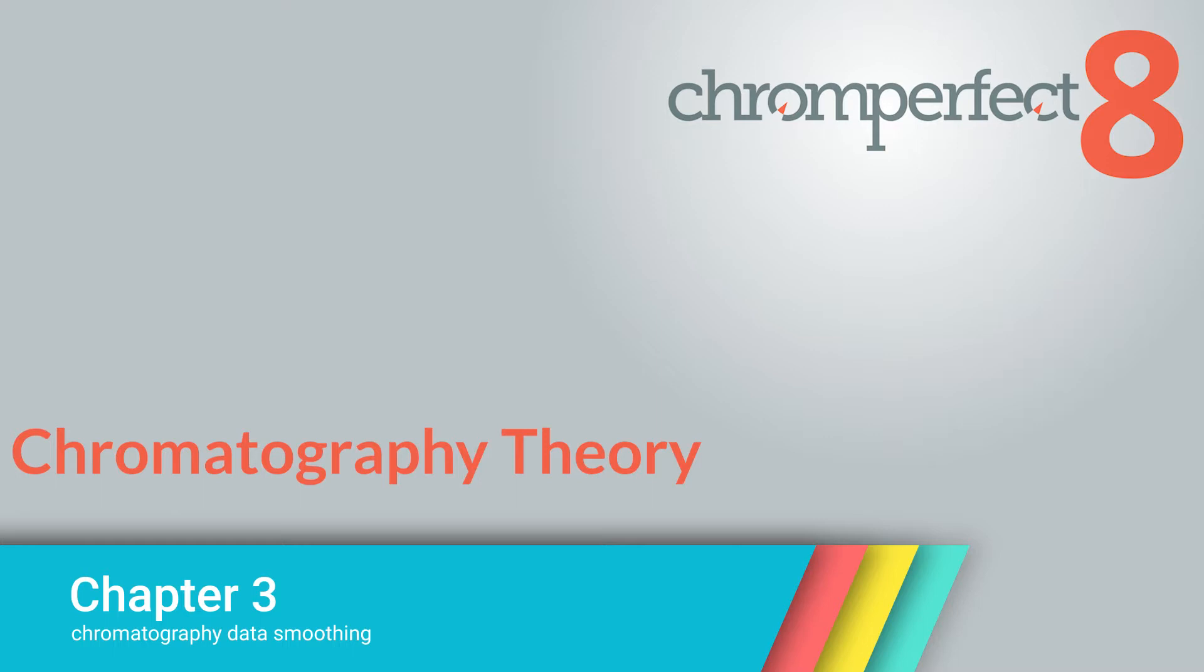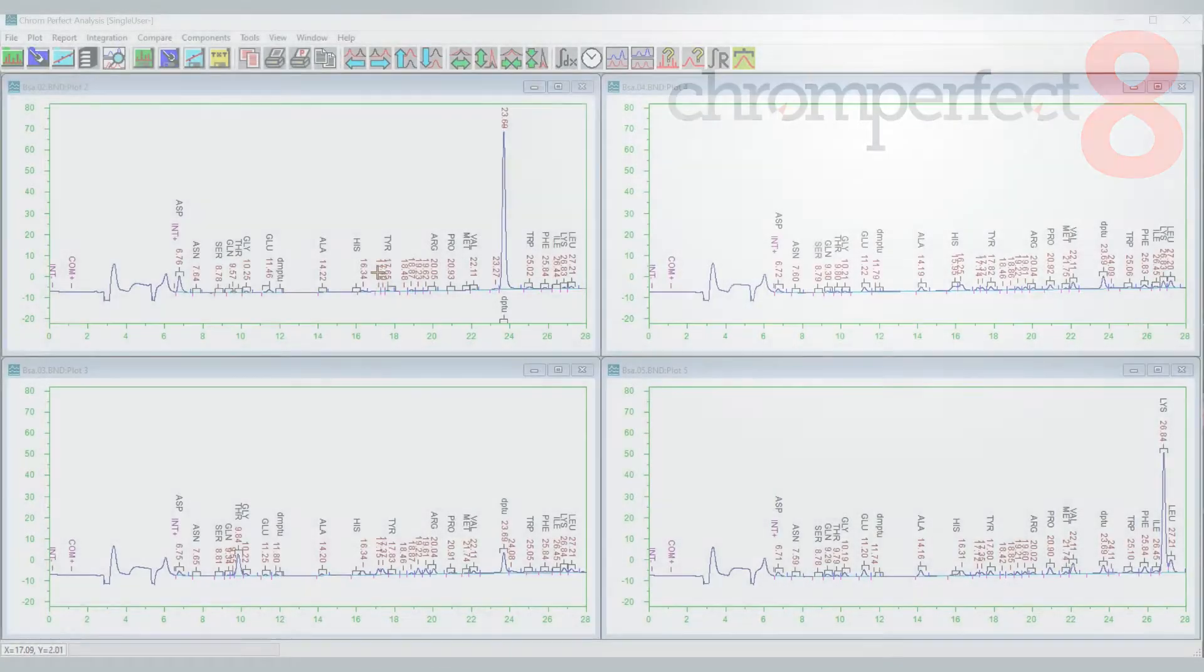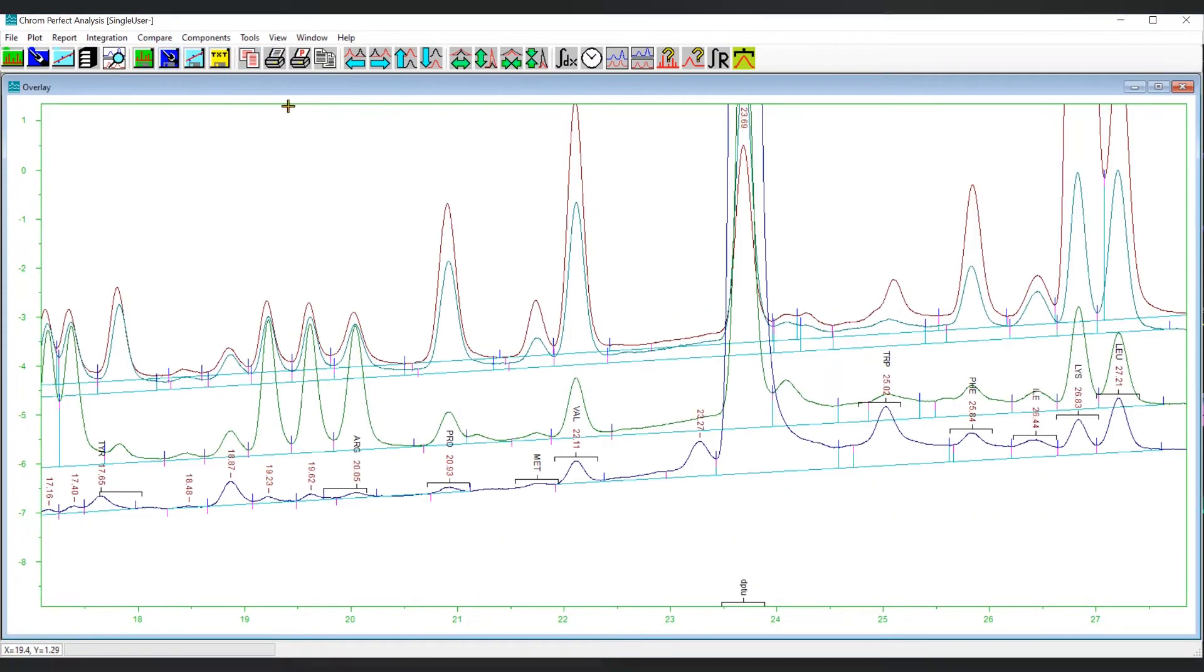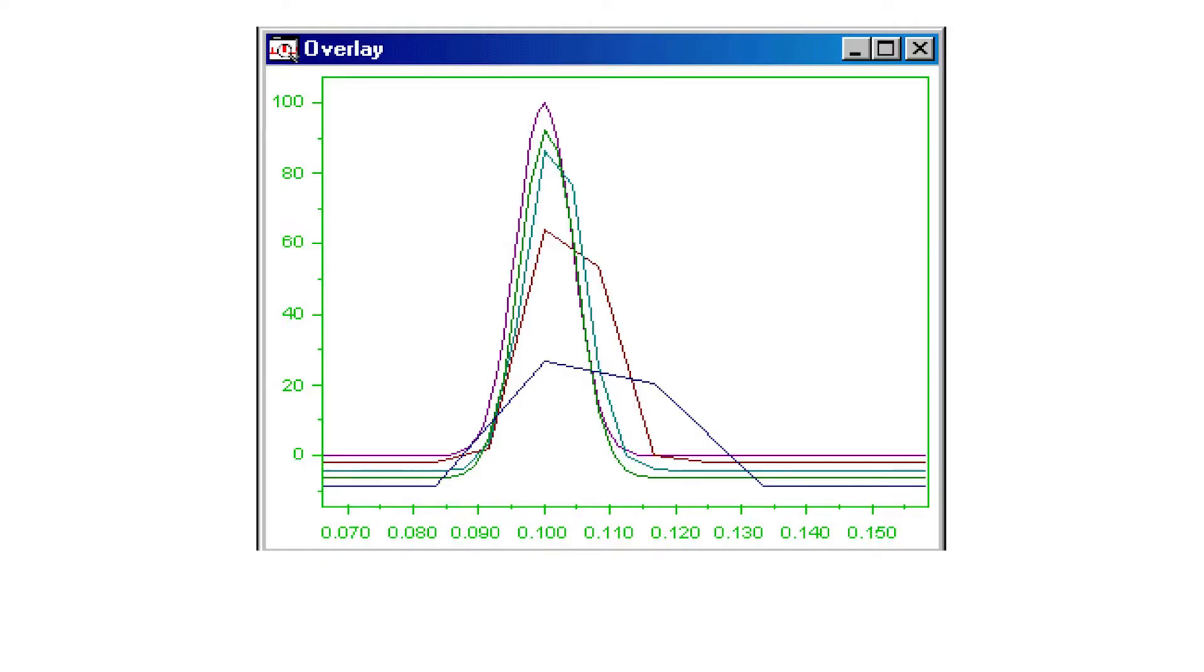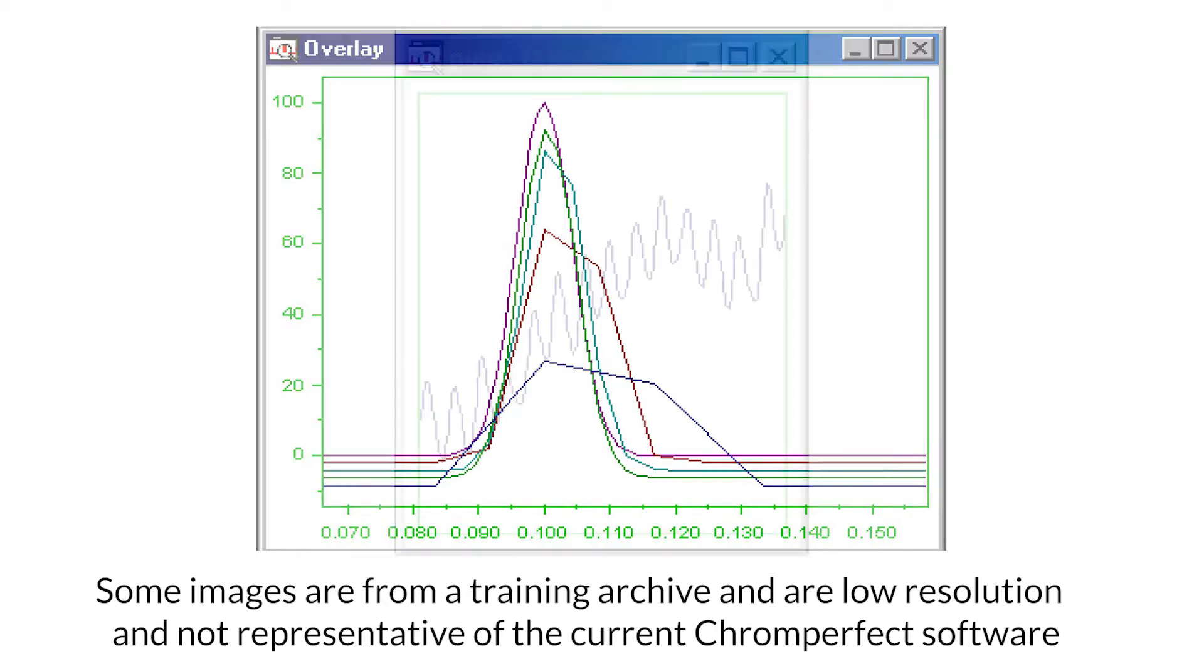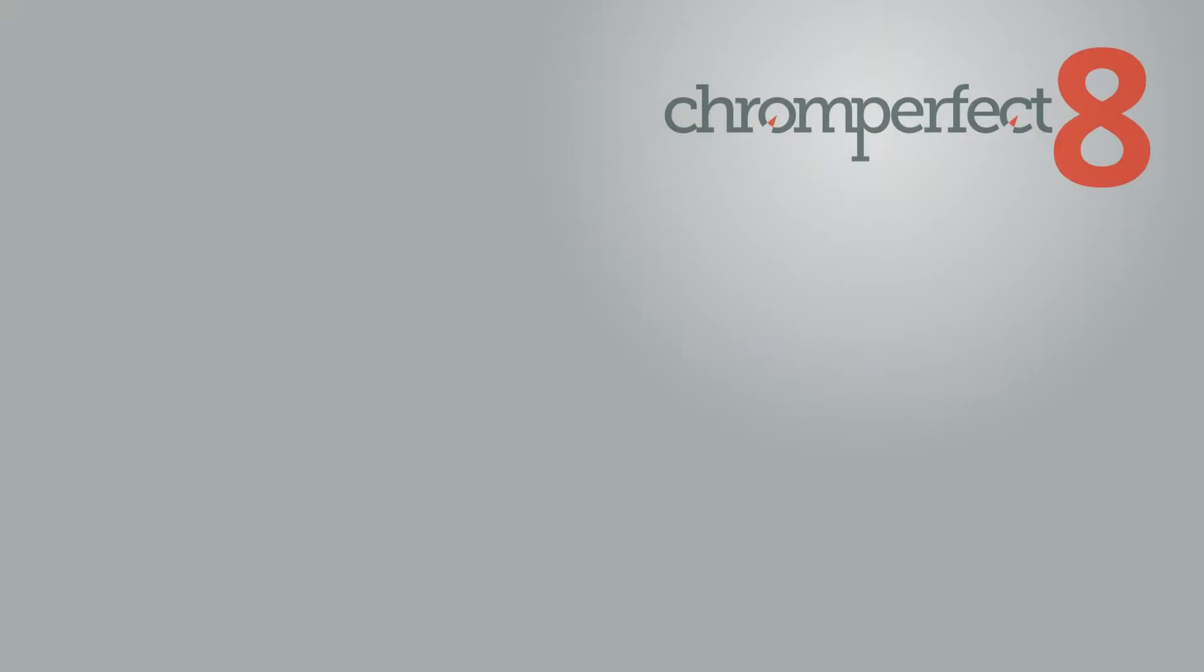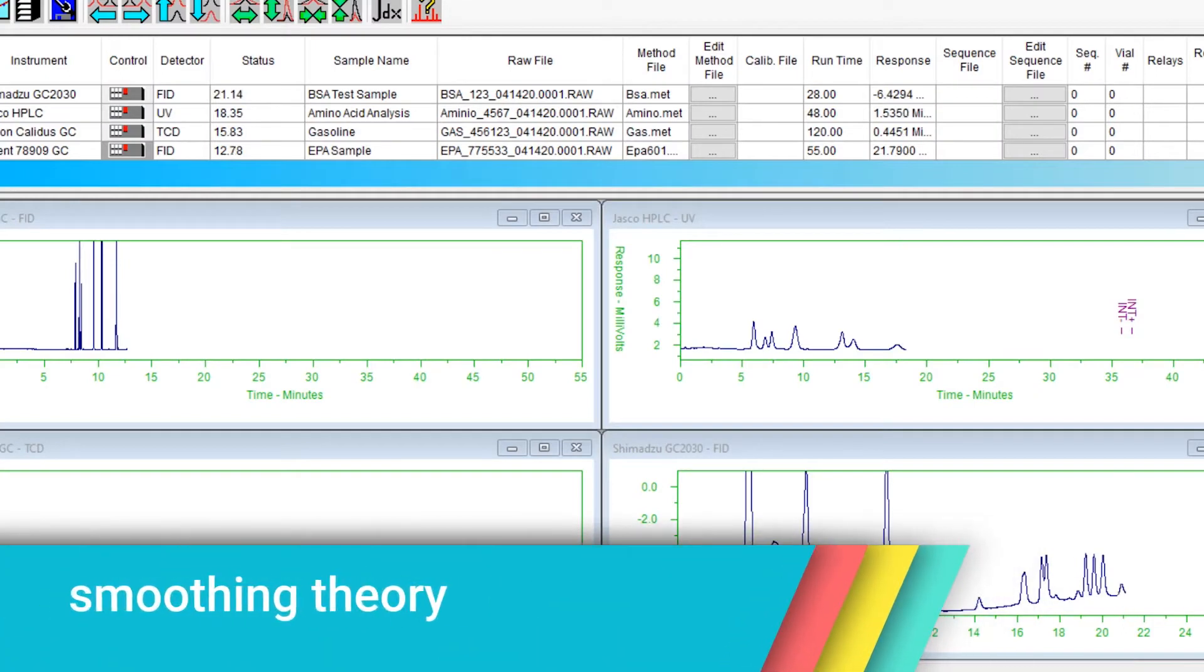Chromatography theory chapter 3: chromatography data smoothing. This educational video has been brought to you by ChromePerfect, the leading independent chromatography data system. In this video we will be using ChromePerfect version 8 to demonstrate the topics being discussed. We will also review some academic images which are fairly low resolution. These are not indicative of ChromePerfect output, however they are useful to demonstrate some of the points of discussion. If you would like more information about our software please visit our website at www.chromeperfect.com or call 973-586-8551.